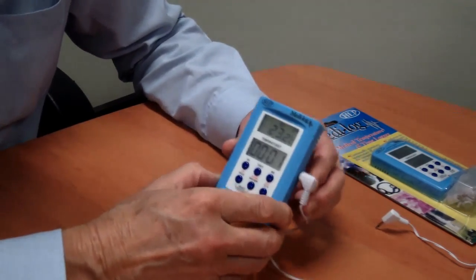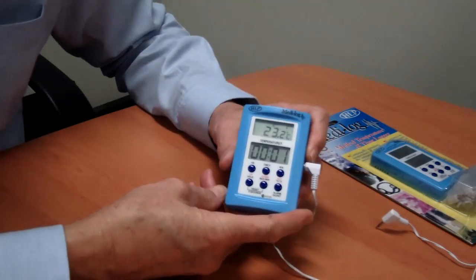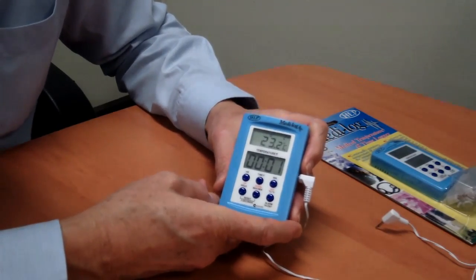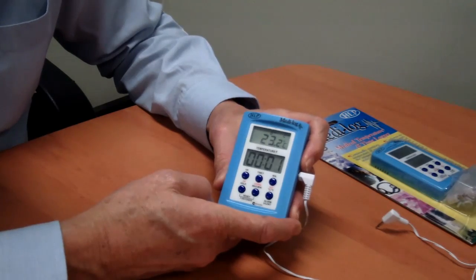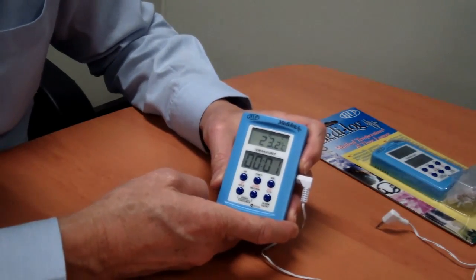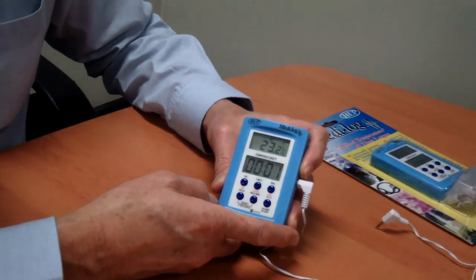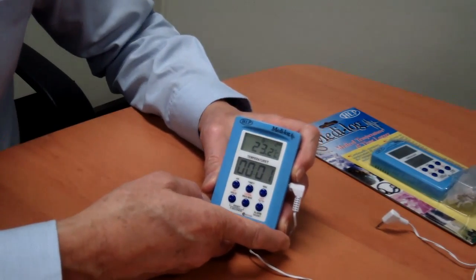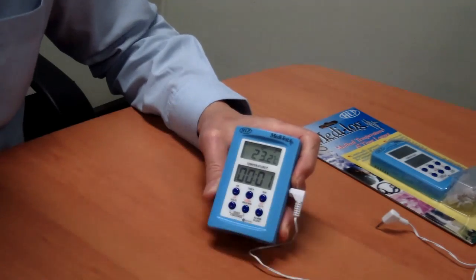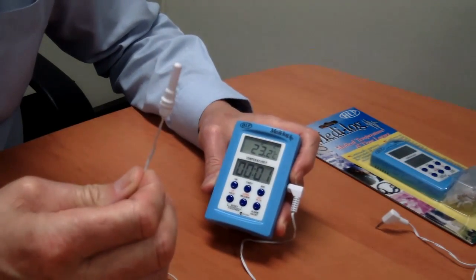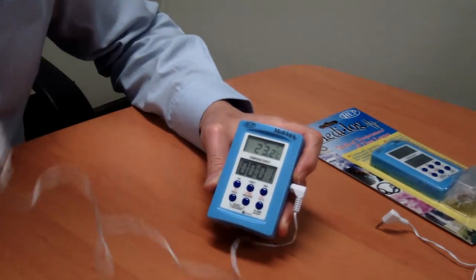This is the close-up of the face of the Medi-Log's unit. It's designed for fridge use for medical vaccine storage, medical blood storage, so it's got some distinct advantages over a normal min-max thermometer. Firstly, the top display shows the temperature on the outside of the probe, so that probe which is on a three meter wire can go inside the fridge. This stays on the outside.